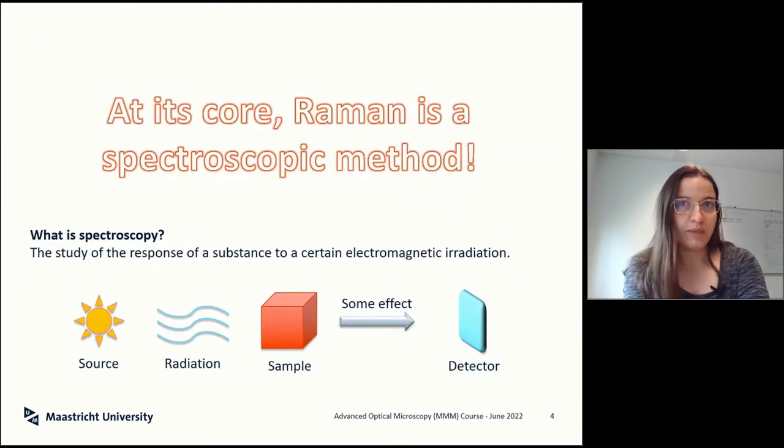So, what is Raman? It's a very chemistry thing at the end of the day. Some physicists actually use it, but if you're not a chemist or a physicist by background, you might not have heard of Raman in your life. Raman, at its core, is a spectroscopic method.